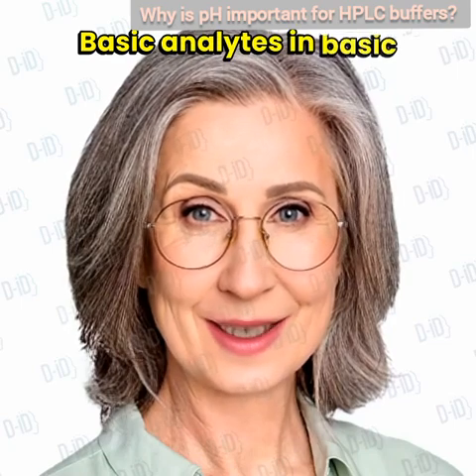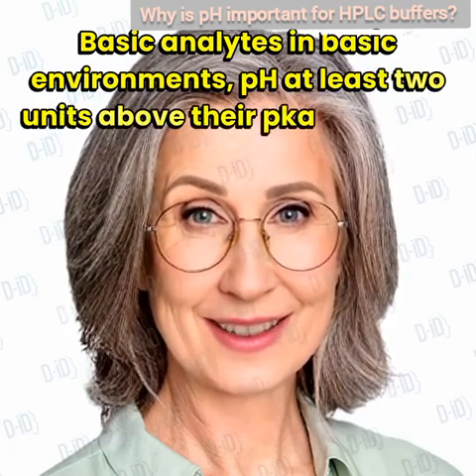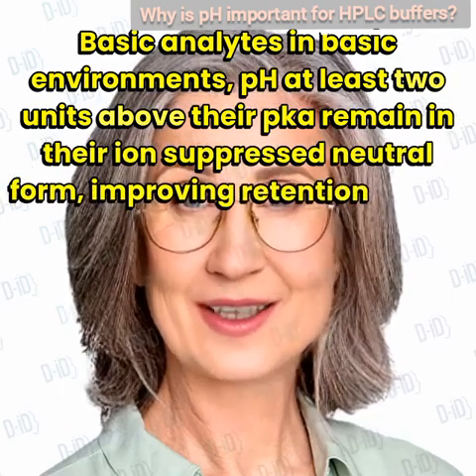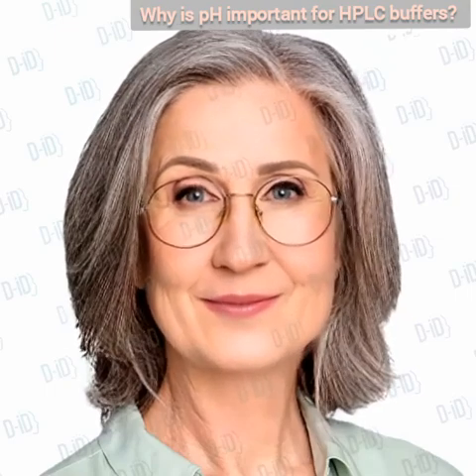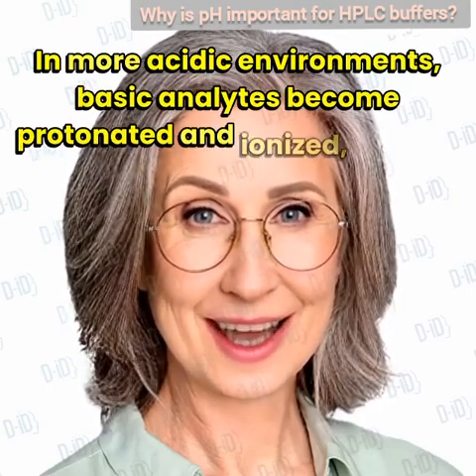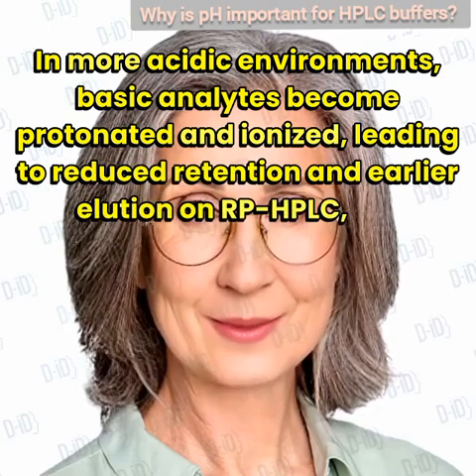Basic analytes in basic environments, pH at least 2 units above their pKa, remain in their ion-suppressed, neutral form, improving retention on HPLC. In more acidic environments, basic analytes become protonated and ionized, leading to reduced retention and earlier elution on HPLC.